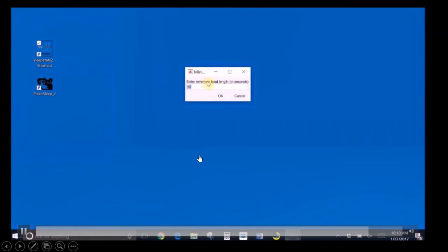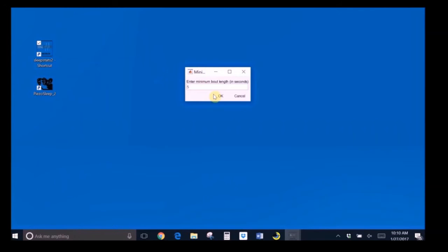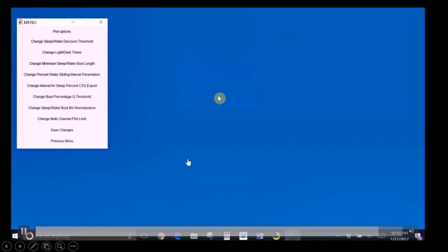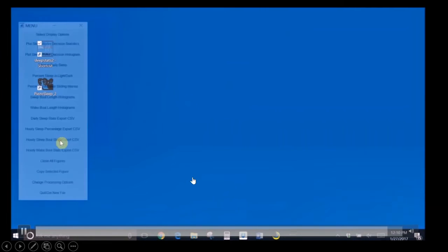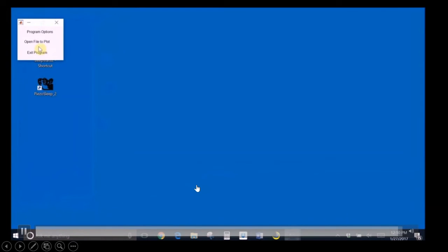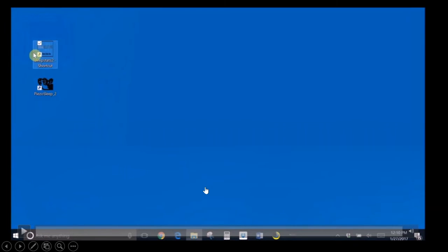All right, here I mentioned you can change this variable. Here the default was 30. You can change it, say, to 5 seconds. Now you can pick up all those little 3-second arousals and 3-second sleep outs. I find for most comparisons it comes out about the same, but sometimes you really do want to see those short ones, so you can, again, redo the analysis under those conditions and just reset things. You can then save those changes or go back to the previous menu, or just, in this case, we'll just quit the file, exit the program, and move on.